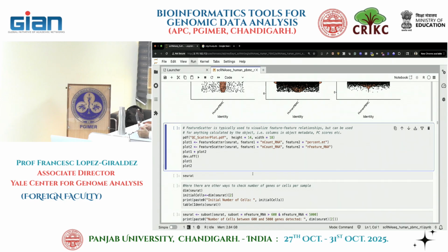First one, I'm not getting it; it's saying syntax error. But why should there be a syntax error in here? And you didn't change anything, right? Yeah, that is the one step. Then there should not be any error. I don't know.